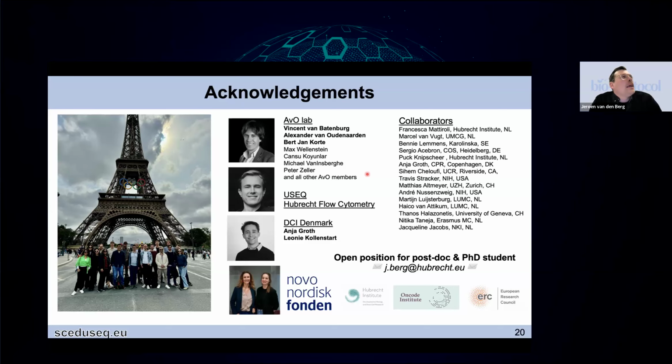It's a very good question. I think the concentration of EDU that we use in these particular experiments is a concentration that a lot of labs have used in the past. We've also looked at whether we can see any defects in cell cycle timing with our concentrations of EDU, and we do not observe any delay in cell cycle progression. So there's no overt toxicity related to the EDU.